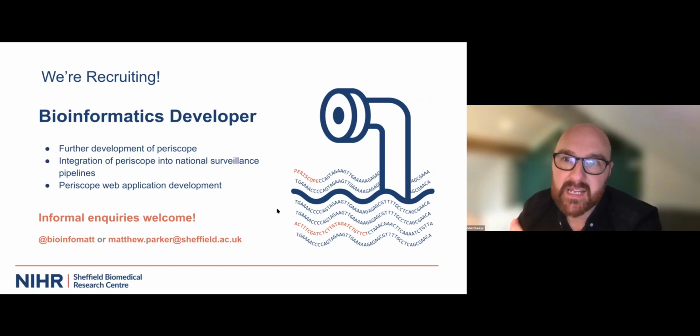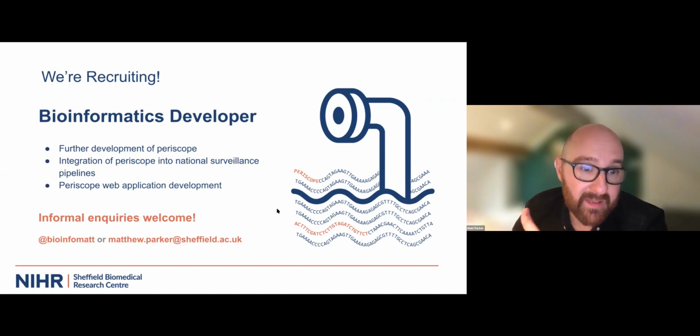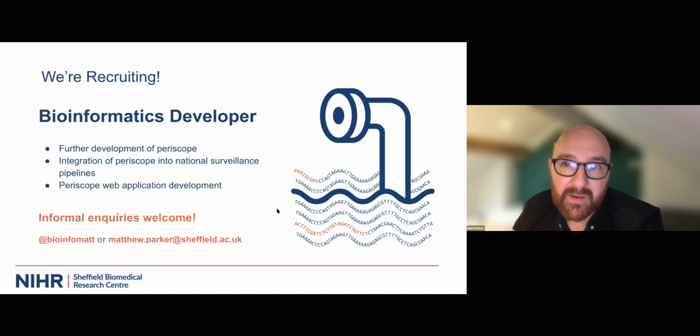We can see an increase in subgenomic RNA. And maybe it's just going to be incremental like we see across the lineages, but maybe there'll be a big jump, and maybe we'll spot something. It's an instant phenotypic readout that we can get from data that's already being produced. So we might as well do it, right?